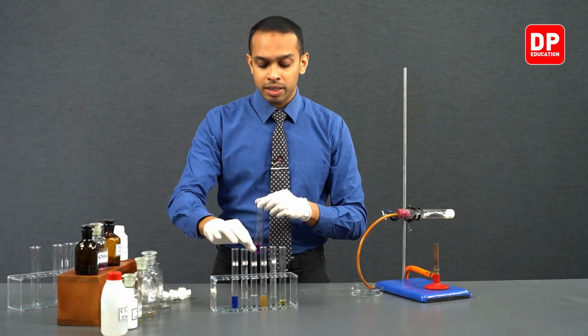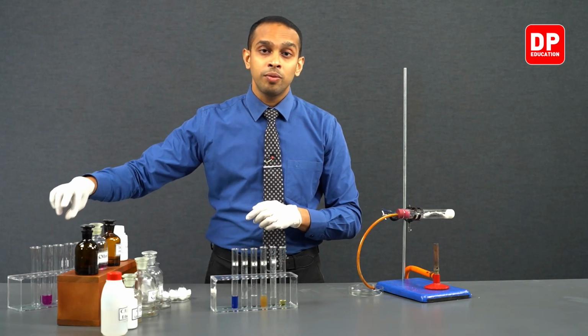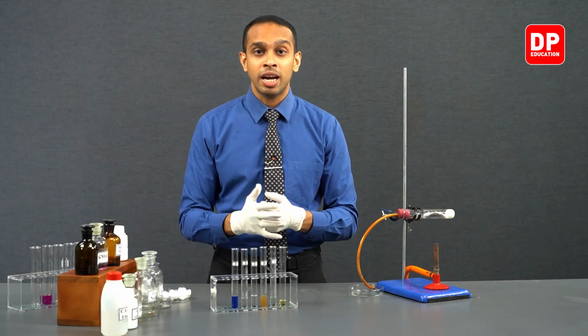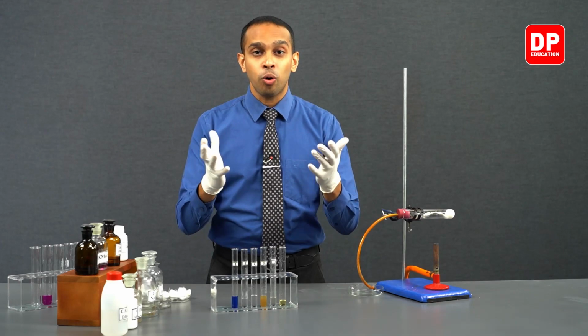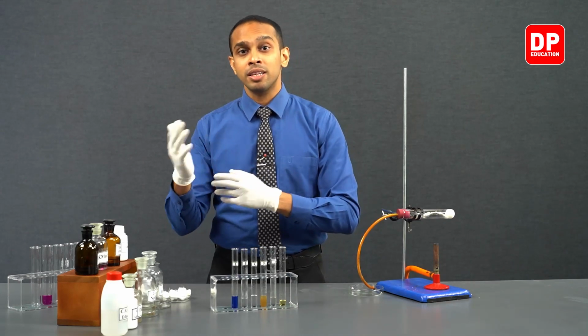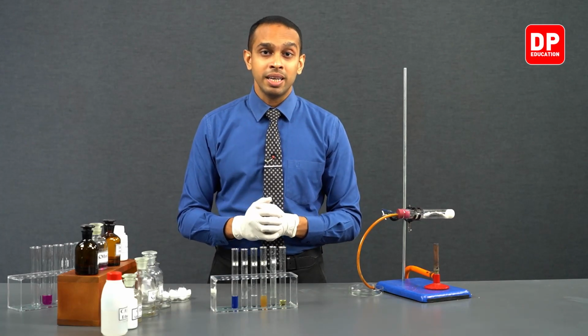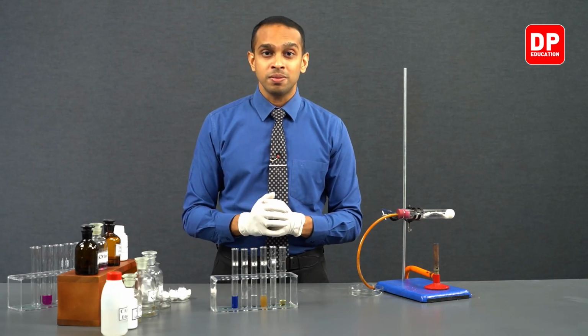Just like in the previous instance, ethene gas, when reacted with potassium permanganate, got oxidized to form diols. Across the double bond, two OH groups got attached to form a diol, and while the ethene gas got oxidized, the potassium permanganate that was present in acidic medium got reduced.